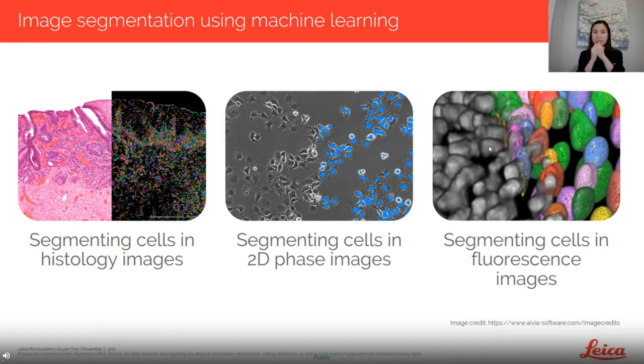I also really enjoy using the pixel classifier and the machine learning algorithms in general to segment and to detect cells that are really difficult to partition based on intensity levels. And the machine learning algorithm just again allows me to take that step further so that I can separate these cells based on more than just intensity and cell size. It allows me to add a lot more complexity to that so that partitioning is significantly better.